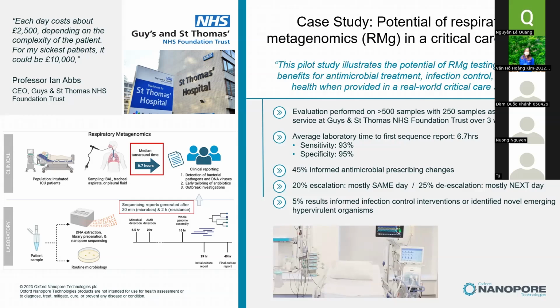But it allows you to know whether you already have sufficient data to stop the sequencing run. And you can then do another analysis with a better or finer workflow that gives you more accurate, higher-accuracy data sets.